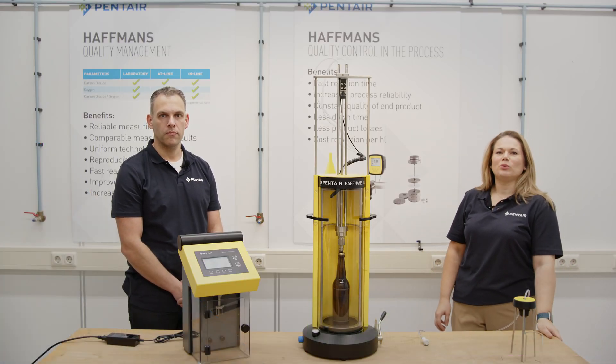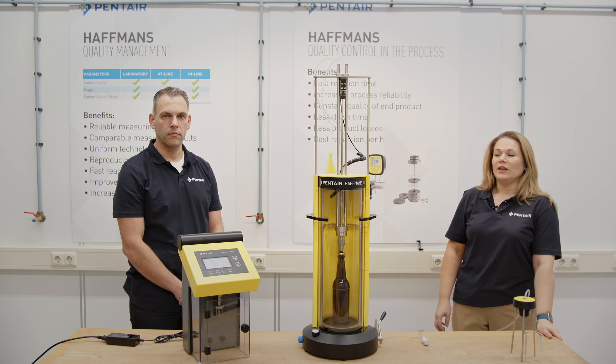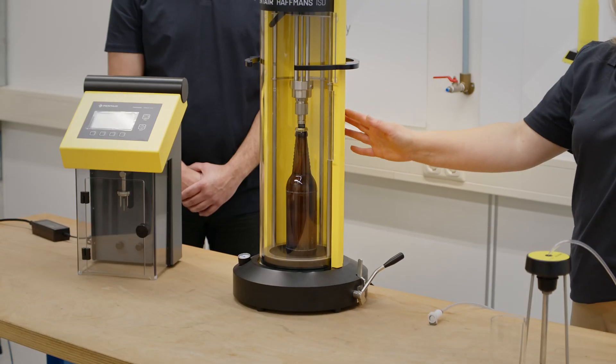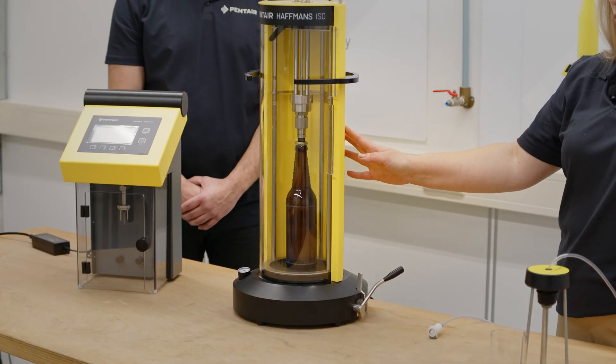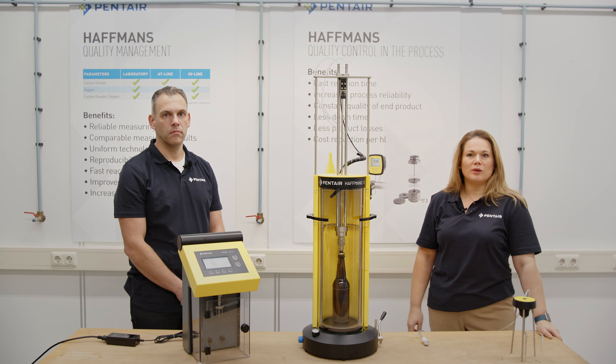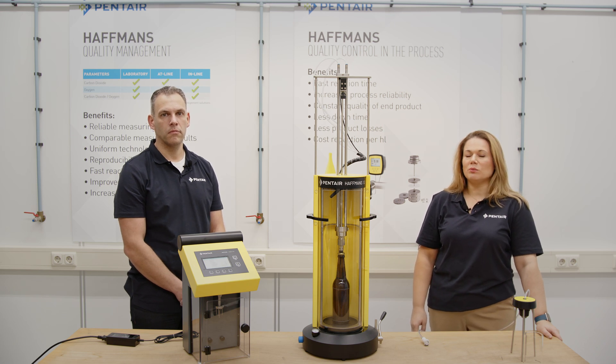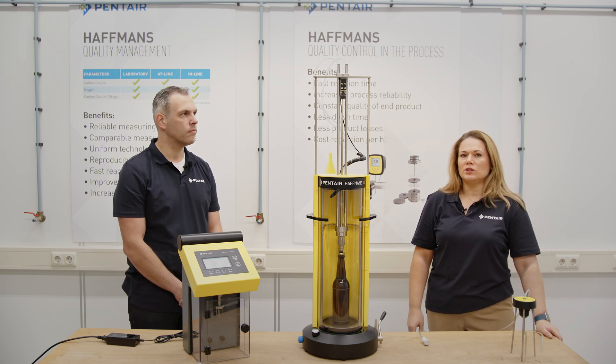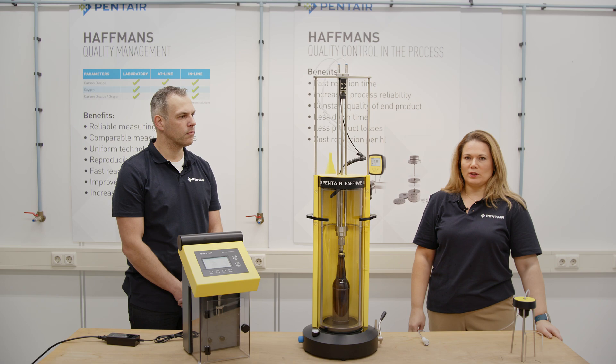Hello viewers! Welcome back to Pentair Haffmans channel. In these Tech Talk videos, we provide you with quick and handy information about our existing products. Today is our second Tech Talk video about our latest development and new sampler type ISD 2.0. My name is Victoria. I'm team leader for Quality Control Product Management here at Pentair Haffmans in Venlo, and I'm together with Frank. Frank is a team leader for Quality Control Research and Development in Venlo.